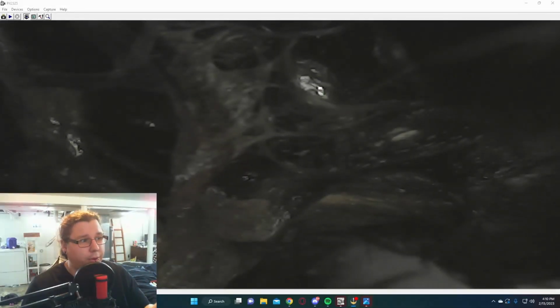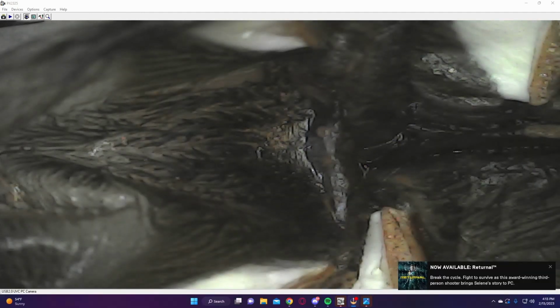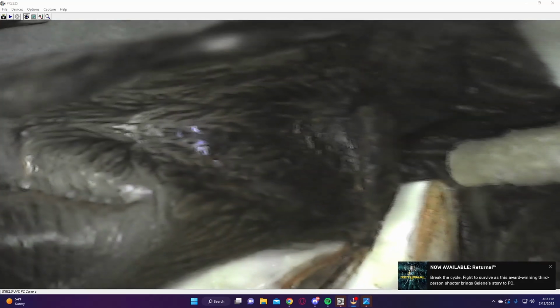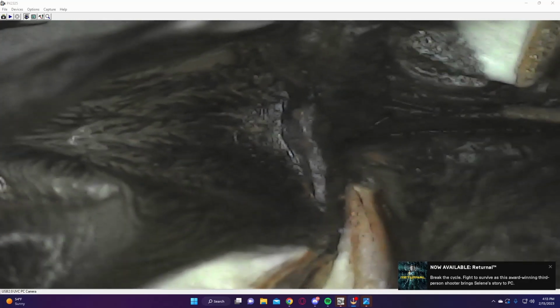Now that we got our molt ready and I got the microscope set up, we're gonna take a look and see if we got male or female. Okay, so we want to be looking through these white things right here, the book lungs. And we want to be looking right in the middle, like right here, where the spermatheca, if I'm remembering that correctly, should be.